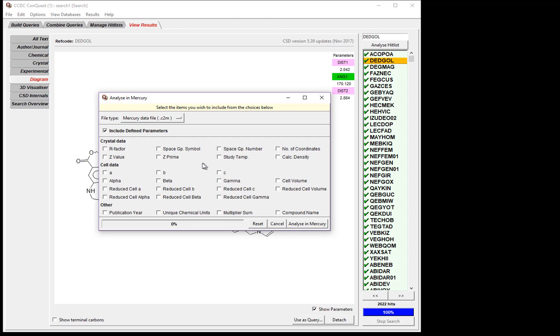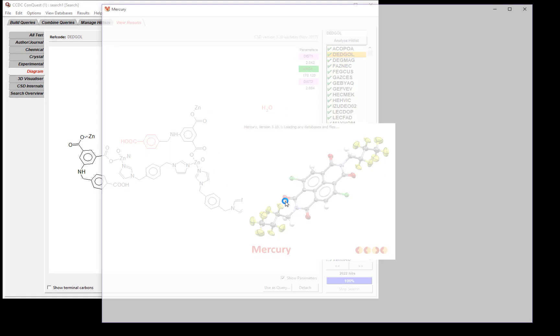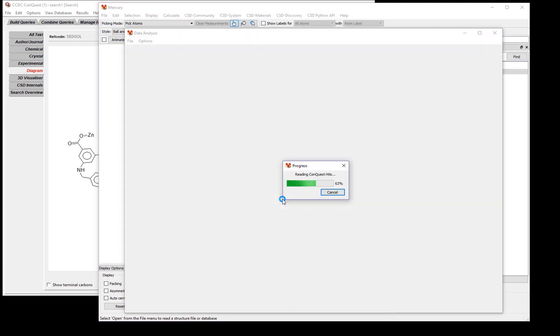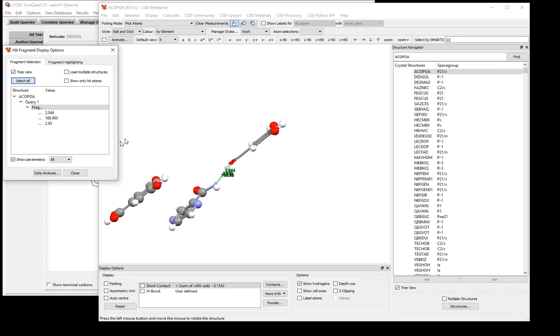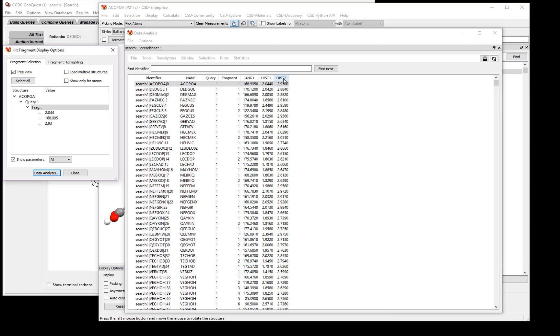We click the Data Analysis button to see the information from our search loaded into a spreadsheet. Here we have the ref codes and the parameters that we were investigating. So our angle, the distance between the hydrogen and the acceptor, and the distance between the donor and the acceptor.